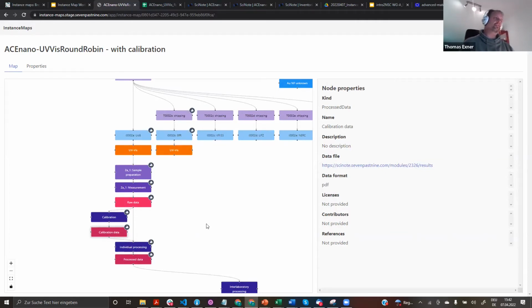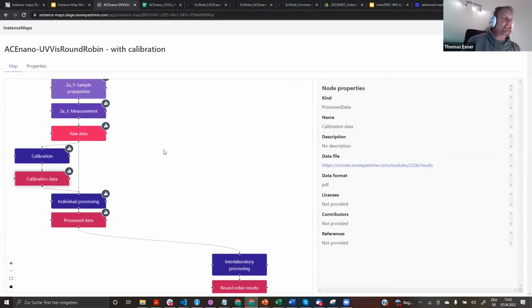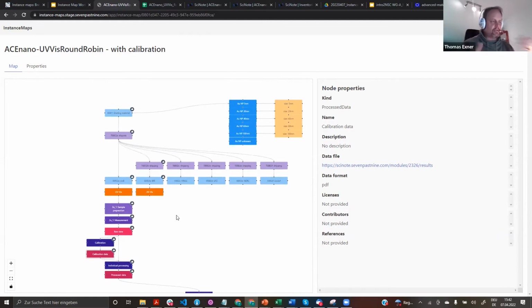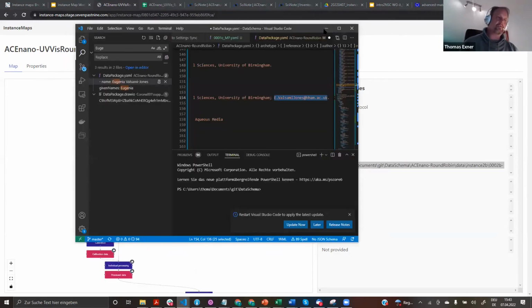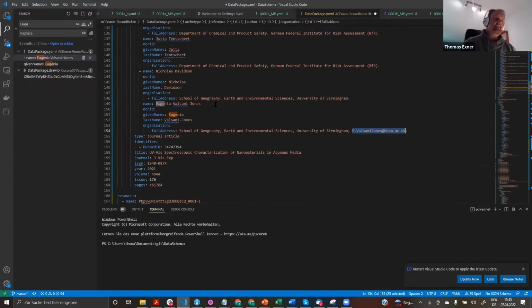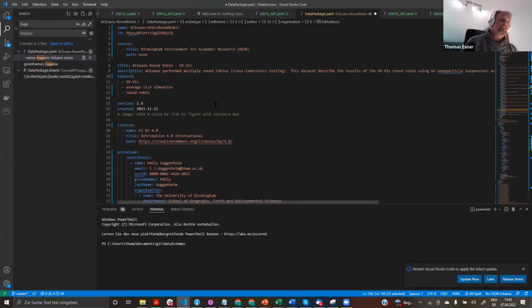The other thing, then I really have to jump to my one. The other thing is that in principle, we can also now create some kind of data files you have. And then this is going back to the things where I am, and these are then on my local hard drive, that you say, okay, I use these strange YAML files. And I just show you one again, because this is clearly not something many people want to see.